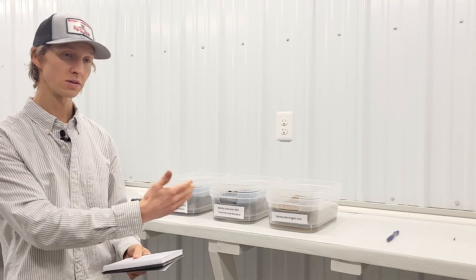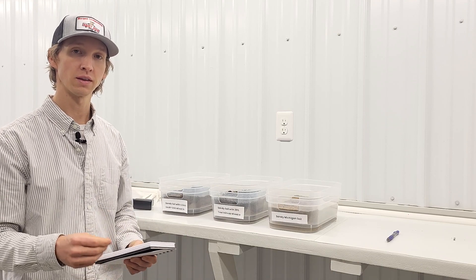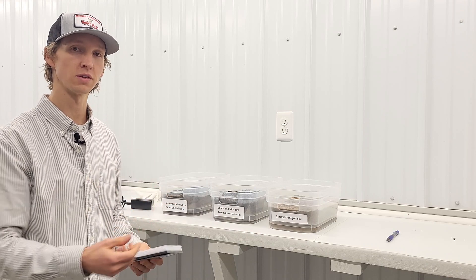These measurements were taken 48 hours after applying the water, and then we're going to come back a week from when we started the experiment to re-measure the moisture content. It's been a week since we started this experiment and I'm going to check the moisture one final time.